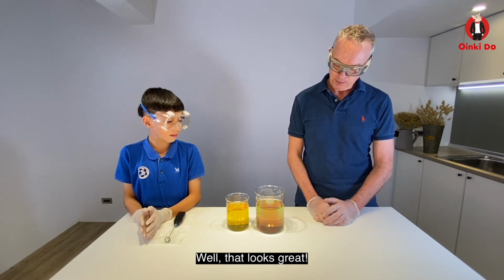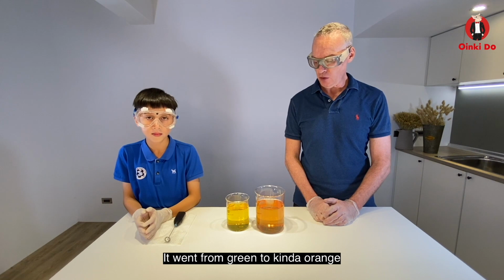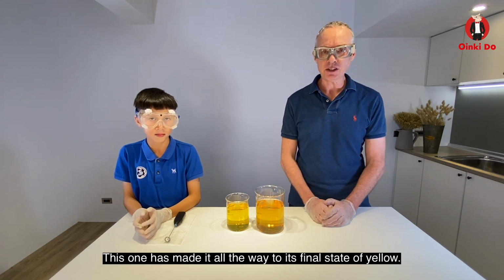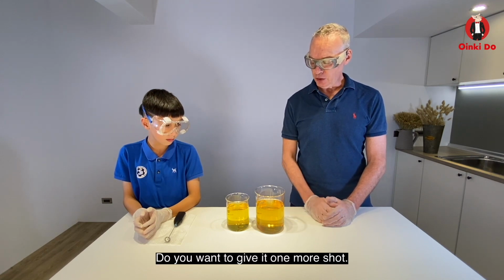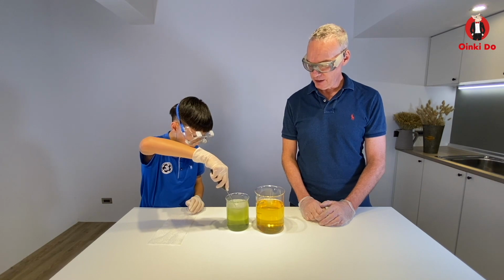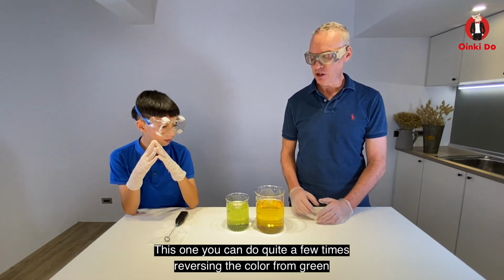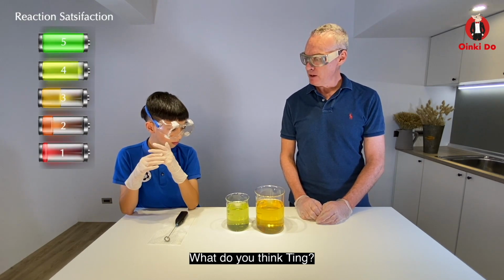Oh, that looks great. It actually happened pretty fast. It went from green to kind of orange, amber looking. This one has made it all the way to its final state of yellow. And this one's almost there as well. You want to give it one more shot? Still quite reversible. Back to green there. And this one you can do quite a few times, reversing the color from green back through the reds and oranges and yellows. What do you think, Ting?